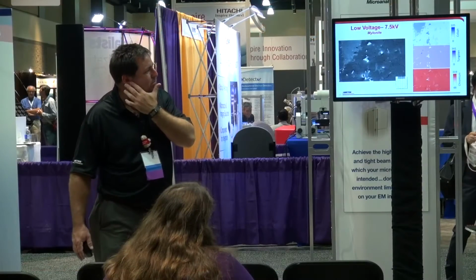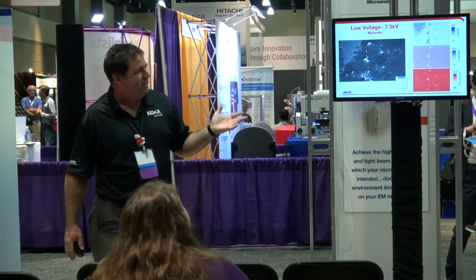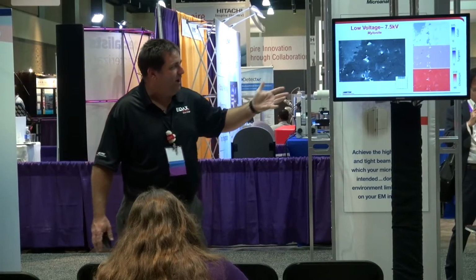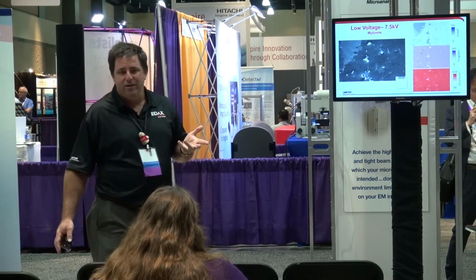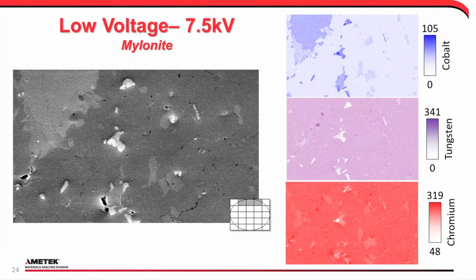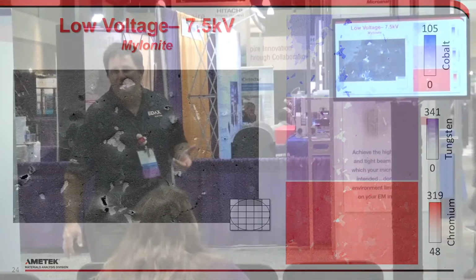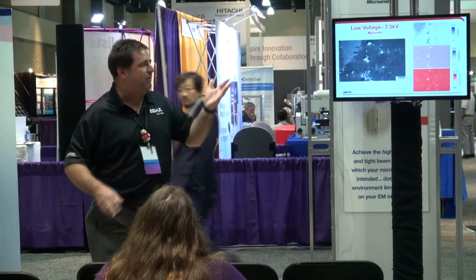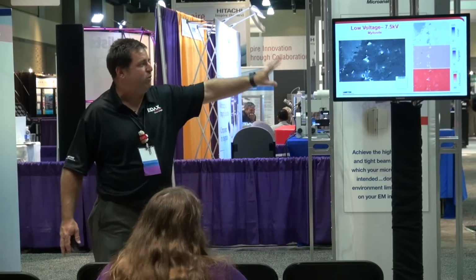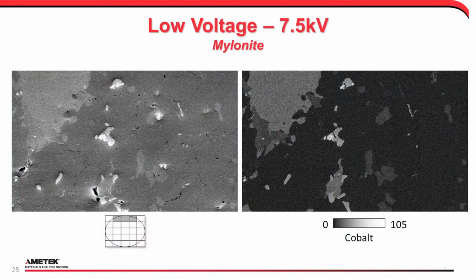One of the interesting potential applications is that because we're not worried about using it as an EBSD detector, there's a lot more freedom to run at different operating conditions without worrying about optimizing the band detection that we would for EBSD. So in this one, it was just taking a material and running it at lower kV to get, again, a phase map, and those are the chemical maps, to say look at how the phase contrast maps even at lower voltage. As we change the voltage, the scattering changes, and we have all those ROIs so we can make sure we get the correct virtual aperture for the type of contrast we want to look for. And that's just showing two grayscale ones to show the correlation.